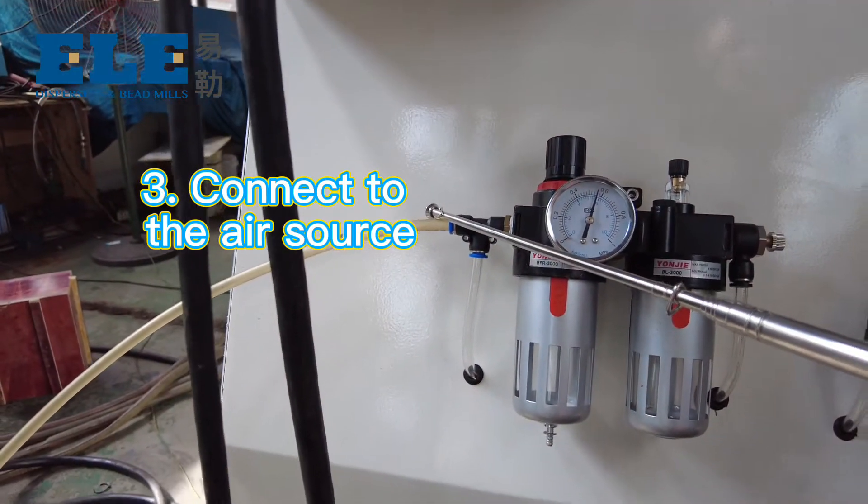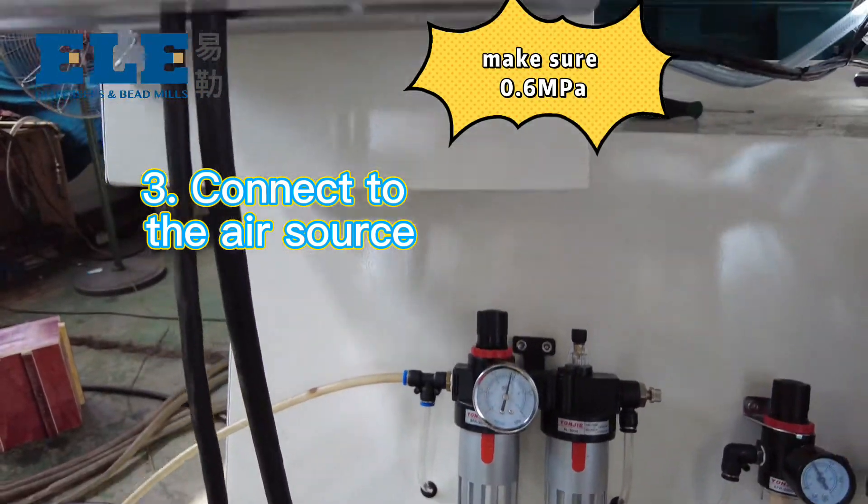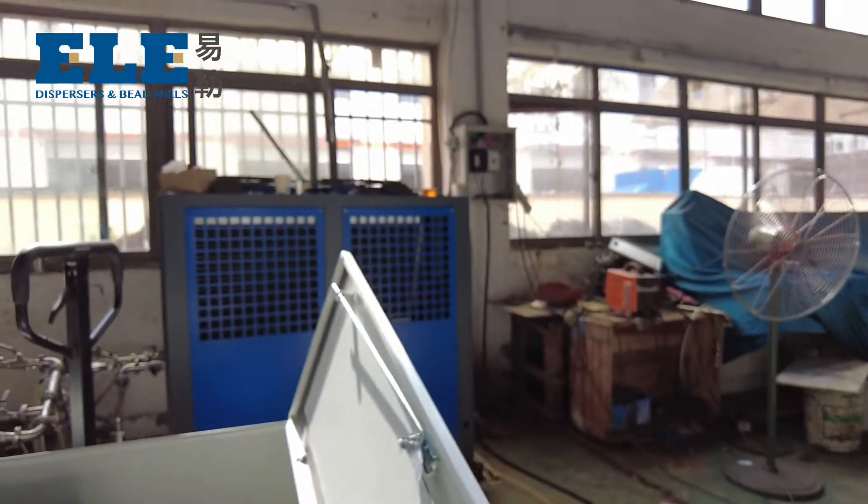Three, connect to the air source. Make sure it is 0.6 MPa on the meter.